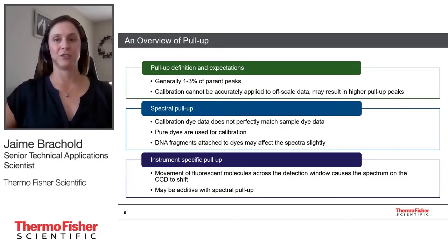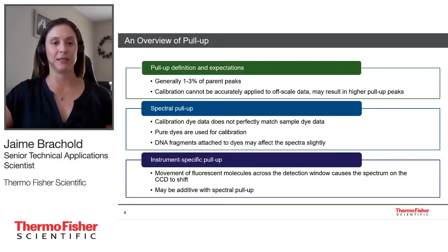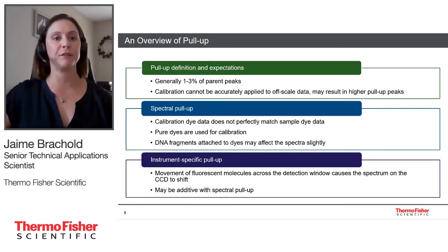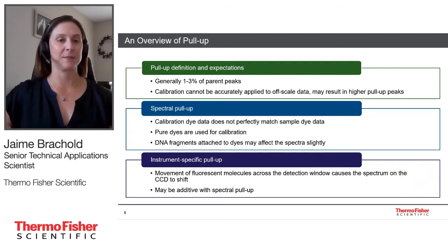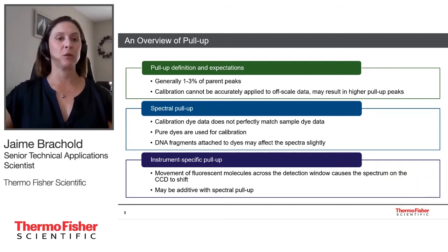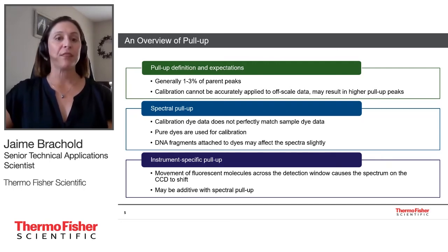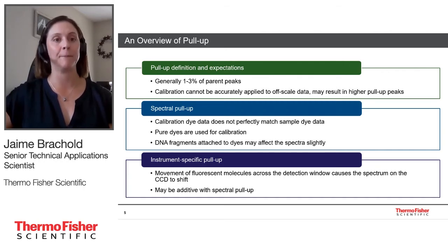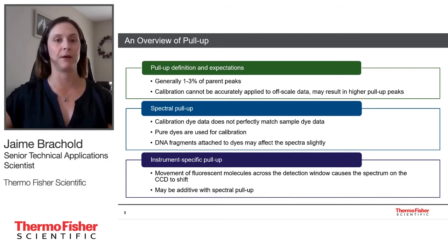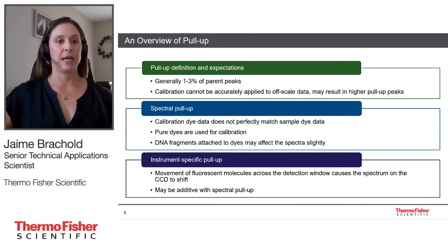Let's get into the pull-up reduction features included with these data collection versions. To make sure we're all on the same page, we'll do a quick overview of pull-up. Generally, we expect pull-up peaks to be within the range of 1% to 3% of the parent peaks they fall underneath. With off-scale data, these values could be slightly higher — you may see pull-up above 3% more often when dealing with an off-scale sample.